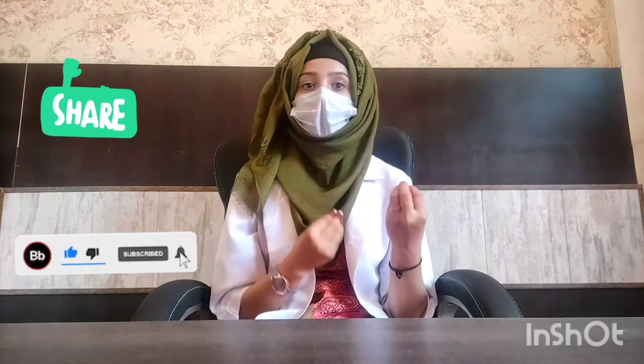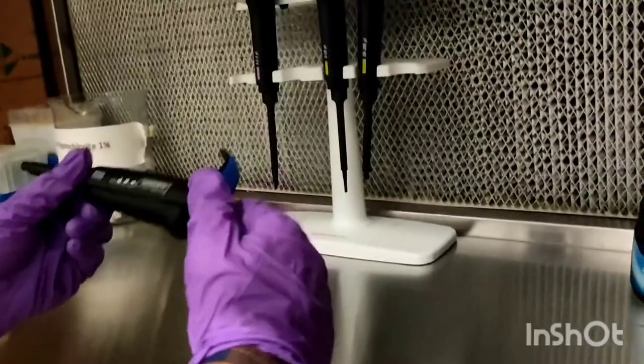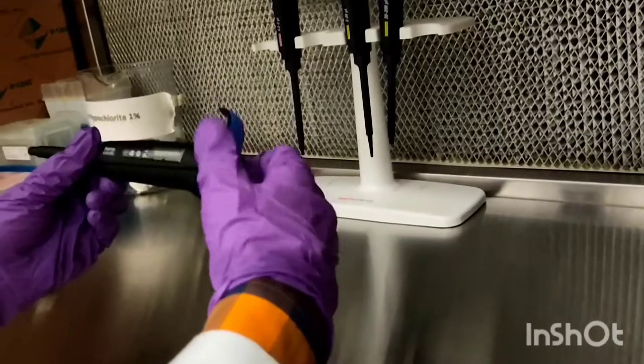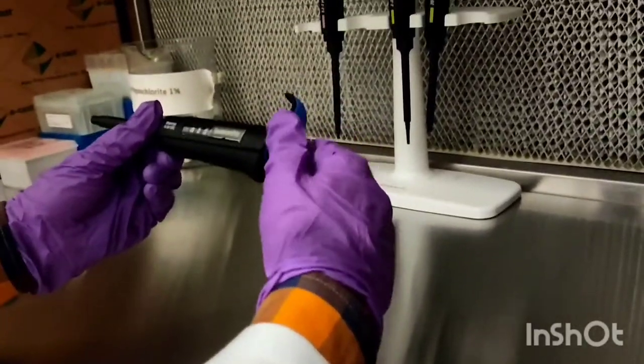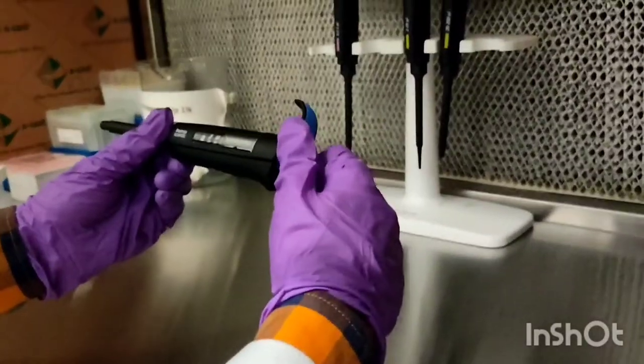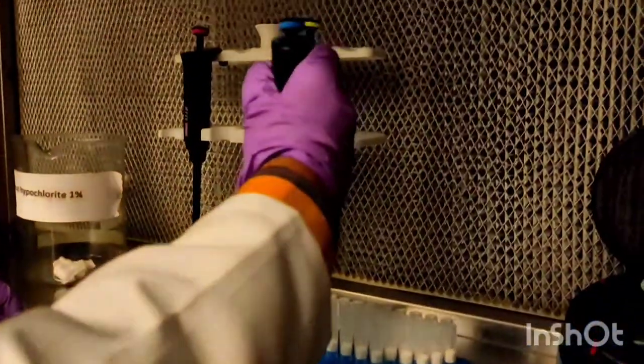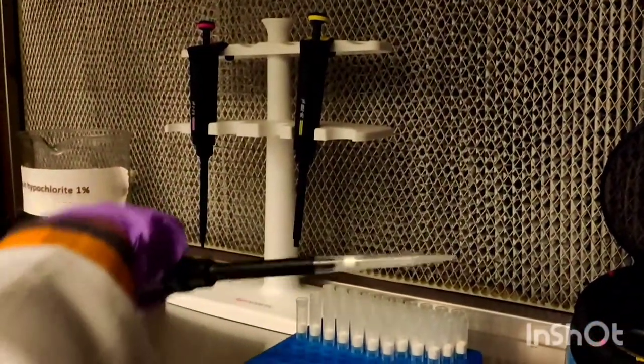So let's just begin with the preparation of master mix. Setting the pipette. So we will make the master mix according to the 30 reactions.